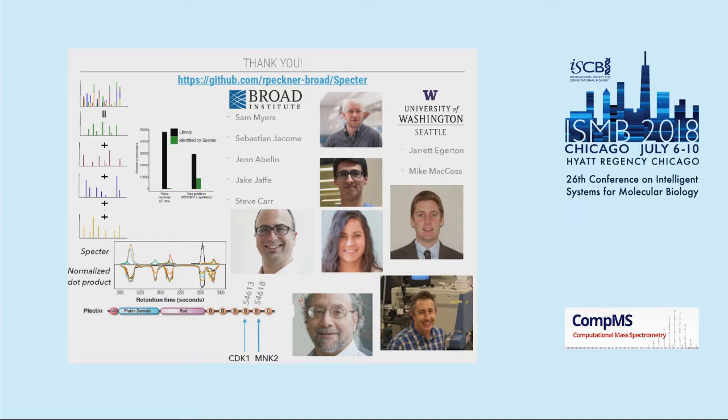I don't have it here. We did it in the context of this LFQbench data set, which involved mixing together the proteomes of 3 different species, E. coli, yeast, and human, and then running those mixtures in DIA. So we downsampled. We took a library that started with all 3 species and then downsampled only the E. coli precursors. And we found that you're still accurately quantifying those E. coli precursors as you start adding larger and larger proportions of the other 2 species as well. So it was something we were concerned about.